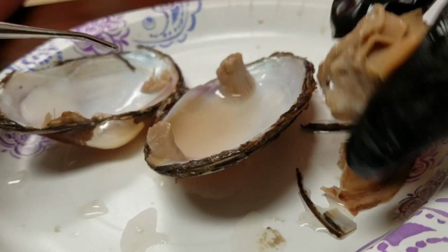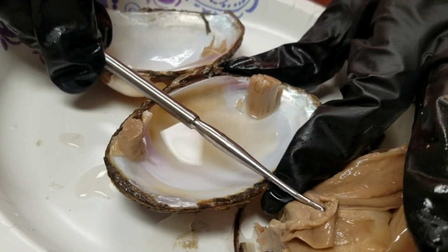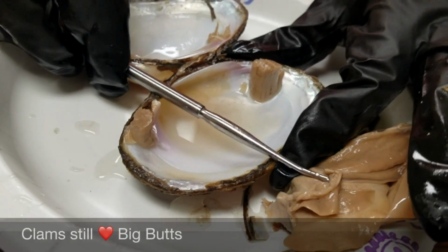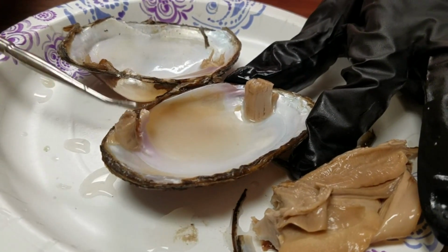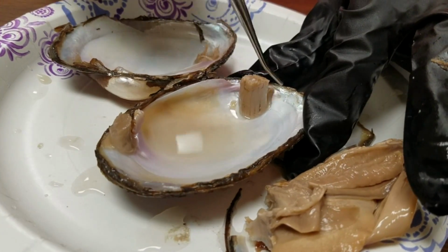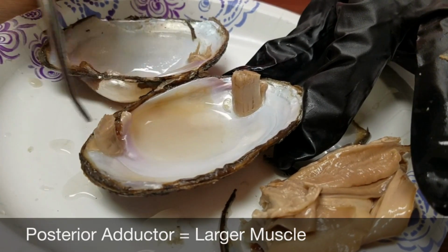So what you can do is pull your whole entire clam body out, and then you can see the muscles. So you have your umbo, okay, here's your umbo right there, and you draw a line down it. And when you draw your line down, remember, clams like big butts and they cannot lie. So this is your butt side. This is your posterior adductor muscle, and here is your anterior adductor muscle. You can tell because this one is bigger than this one. Your posterior, your butt side, is always going to be bigger than your front side over here.